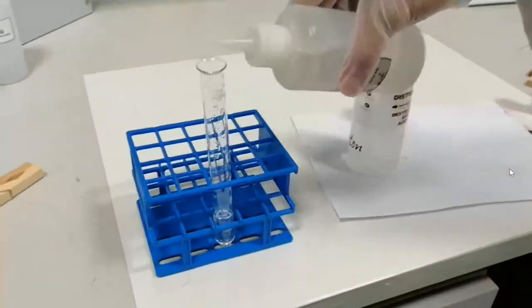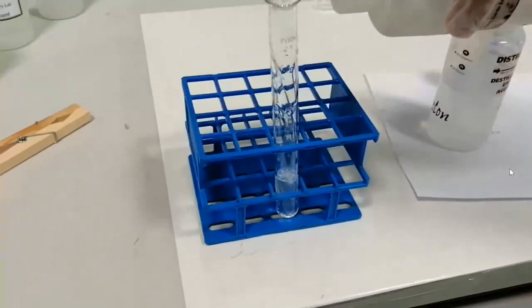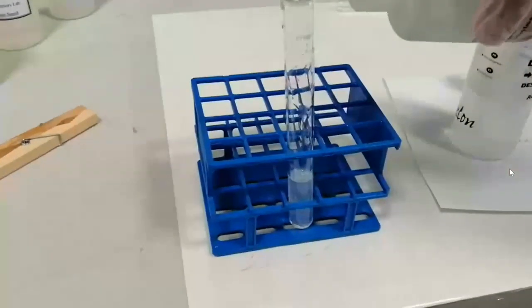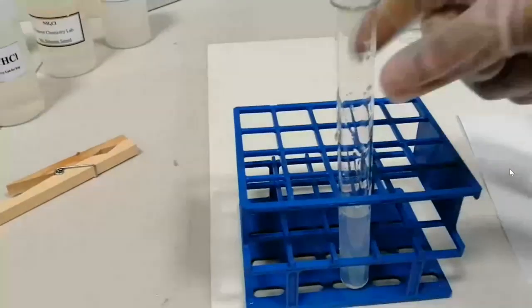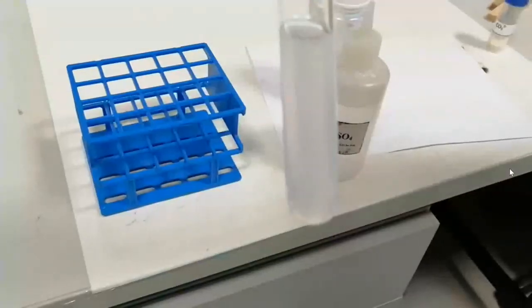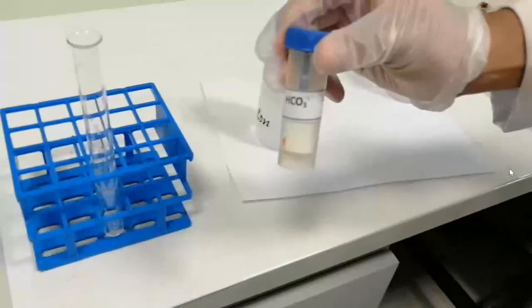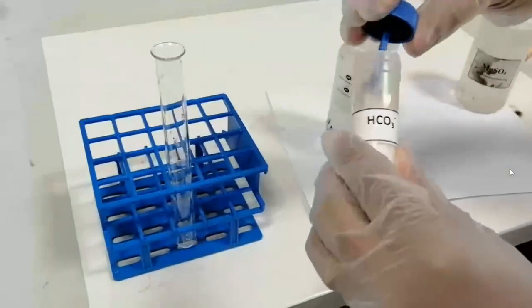Okay, just add the reagent. You will see a white precipitate is formed at once. You can see the turbidity, which means the precipitate of MgCO3, magnesium carbonate, is formed. Very good. The same observation you will see for bicarbonate, but after heating.